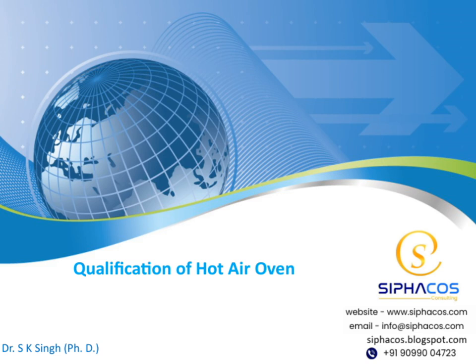Today, we'll be talking about the qualification of hot air ovens. My name is Dr. S.K. Singh, and I hold a PhD in this field. This is the first slide, so I want to start by giving you a quick overview of what we'll cover. We'll explore the essentials of hot air oven qualification, including standards, procedures, and best practices. So, let's get started and dive into this important topic.